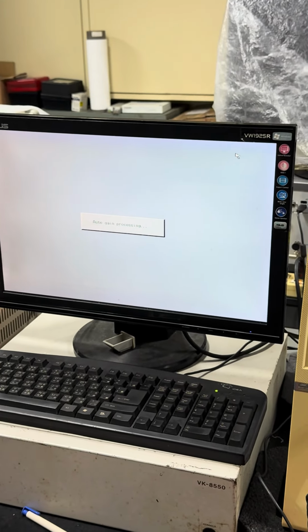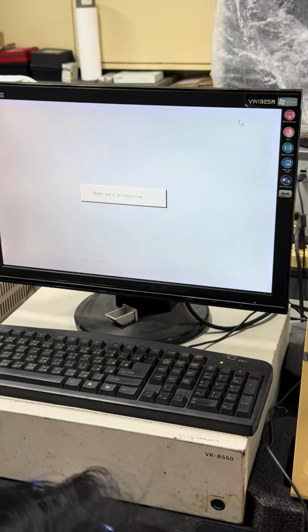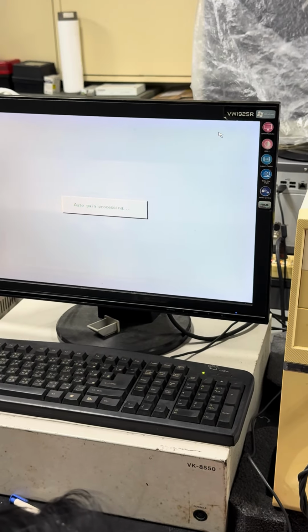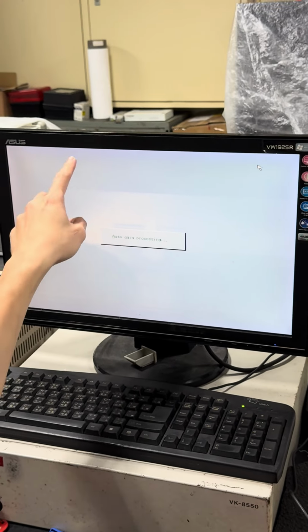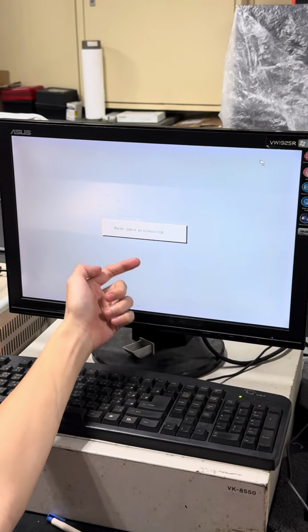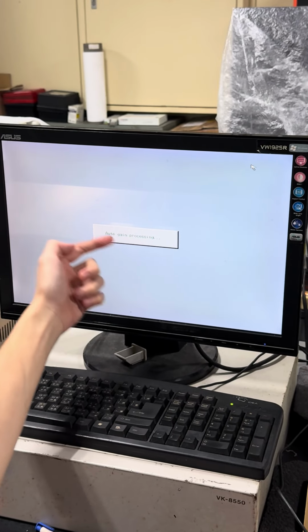It will take time, so we can wait for a while. See, the laser is scanning from the high area to the low areas we set before. You can see the change slowly happening.